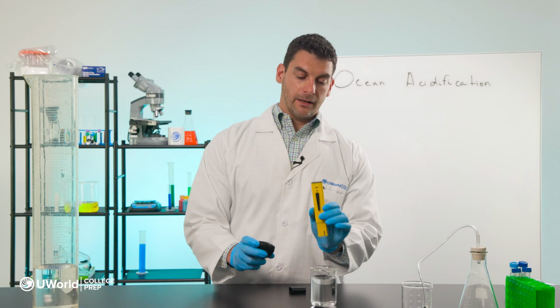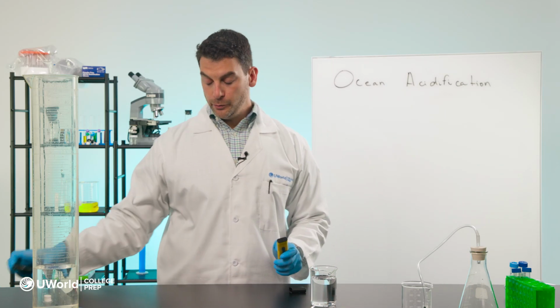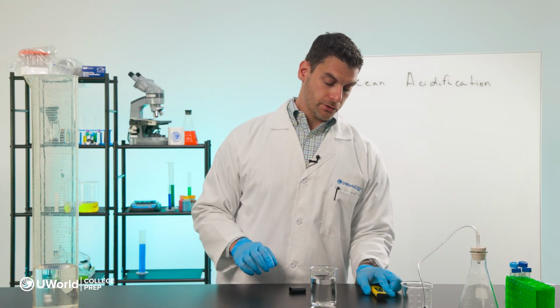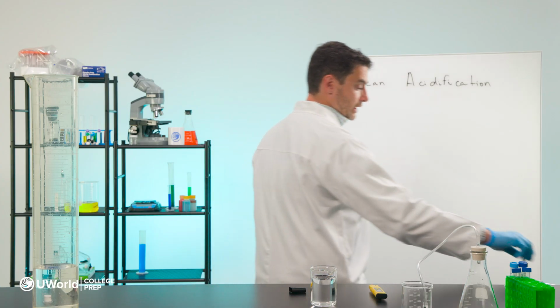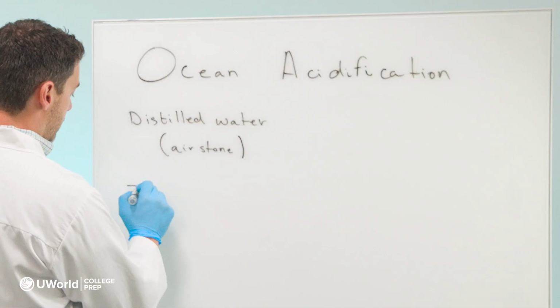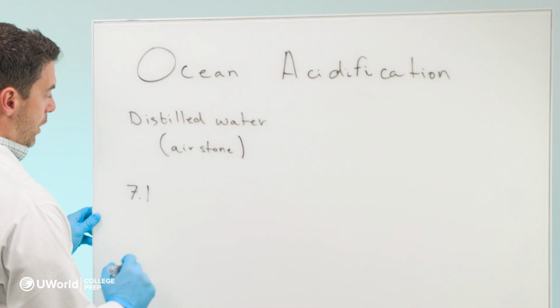And lastly, now that we're done at our 2-minute mark, we can take it out. And I looked at the pH right before I took it out, and we can start recording our data. We started with pH of 7.1.